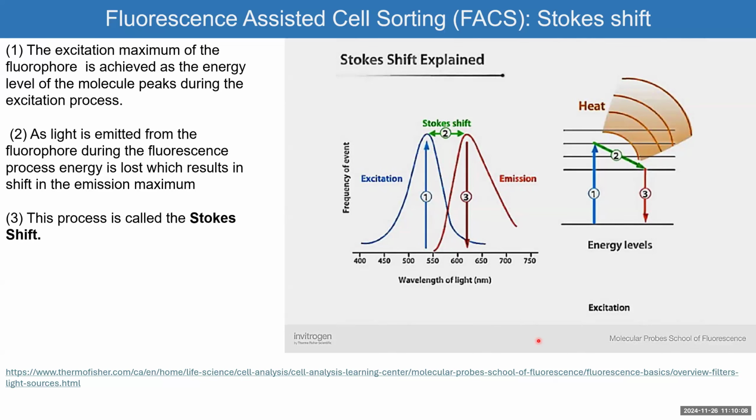But what I want you to know is this: we mentioned that we use antibodies that are tagged with a fluorescent tag, right? We mentioned FITC, or green fluorescent protein, or YFP, which is yellow fluorescent protein. For each fluorophore, there are two different patterns of wavelength that you should know.